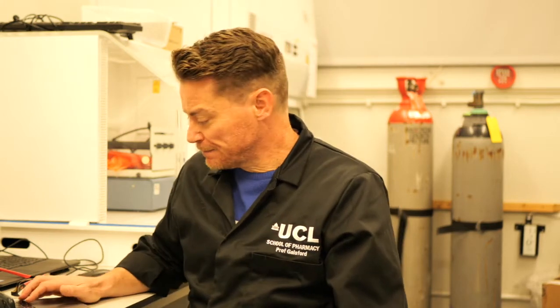It's quite important that when you're preparing your sample for a microscope that you prepare it in the light of how the microscope is actually working. So for instance, quite often, I'm sure you're aware, you might slice a sample in thin layers before you image it, and that's simply because you want to use transmitted light and it won't go through a thick sample. Or maybe you're not interested in the surface of the material, you're looking at the core, and so if you have a light underneath it and the sample's too thick, you won't see anything. So you've got to prepare the sample in the right way for the type of microscopy that you're using.